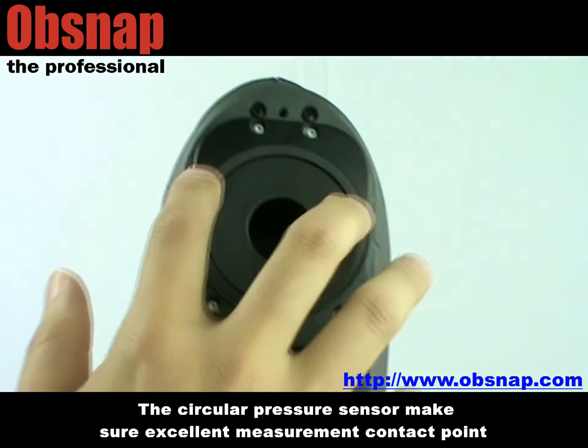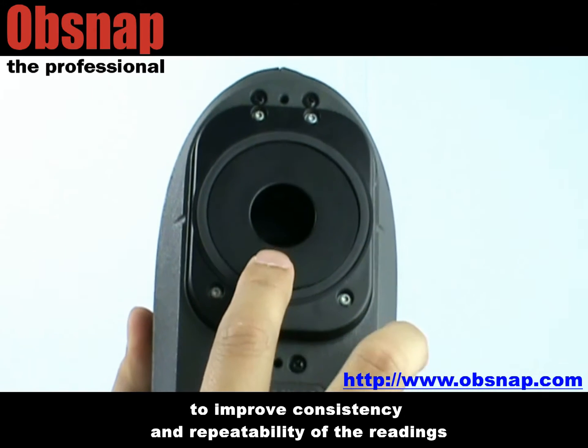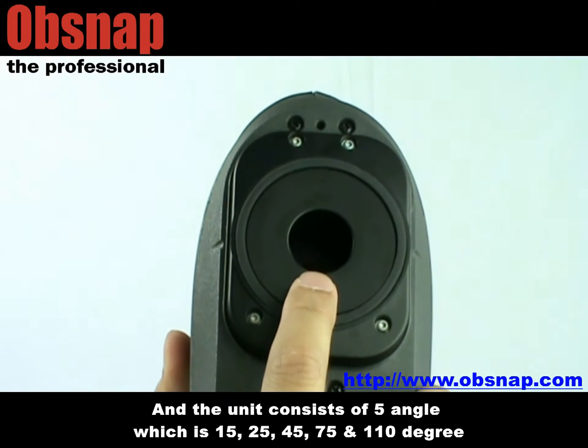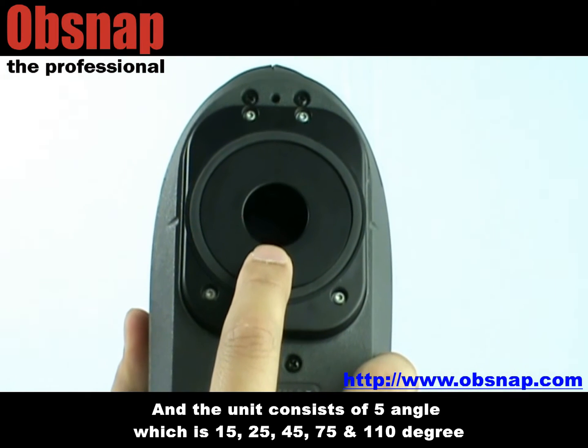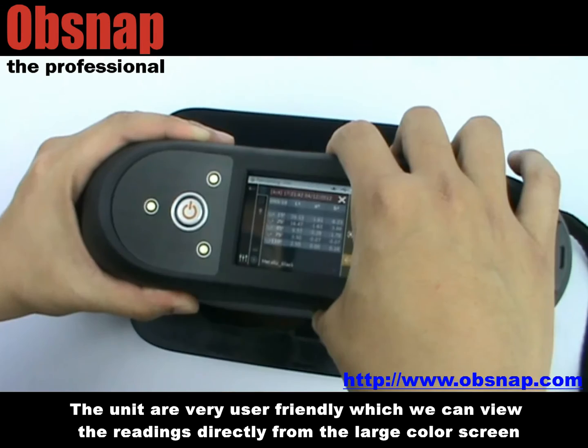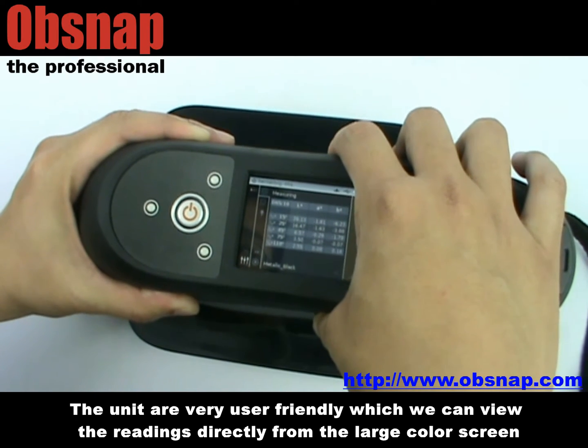The circular pressure sensor measures excellent measurement contact points to improve consistency and repeatability of the readings. The unit consists of five angles: 15, 25, 45, 75, and 110 degrees. The units are very user-friendly, which allows us to view the readings directly from the large color screen.